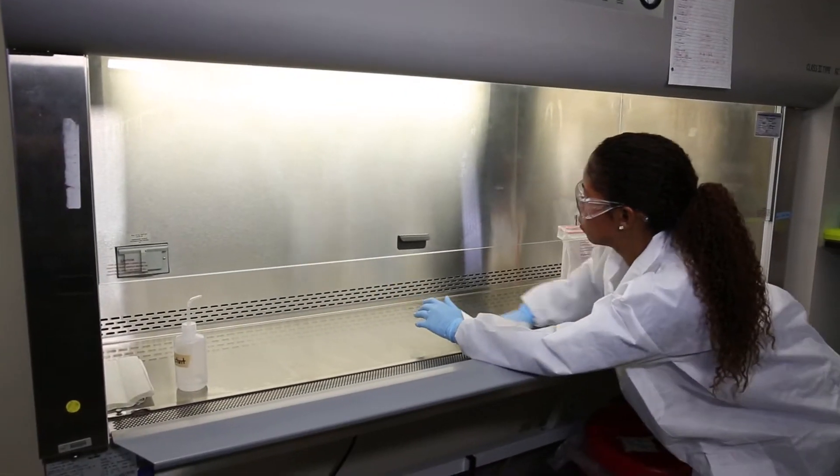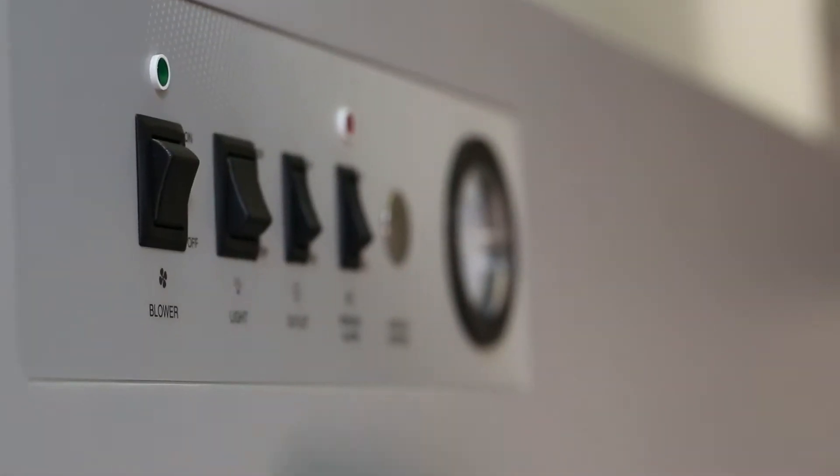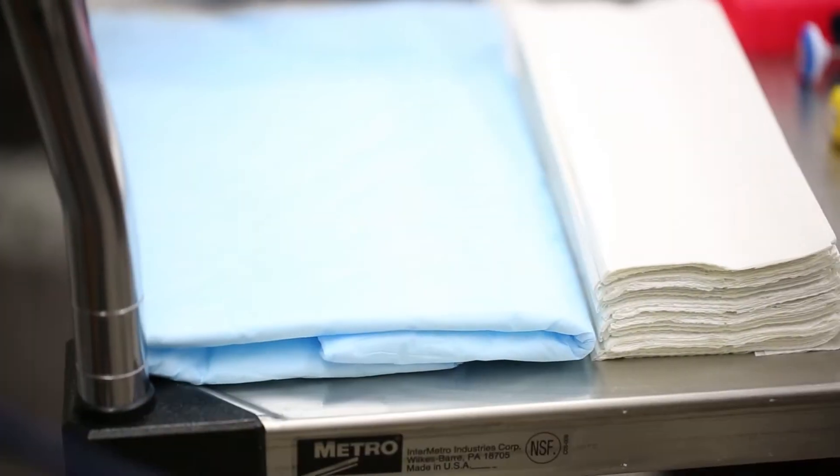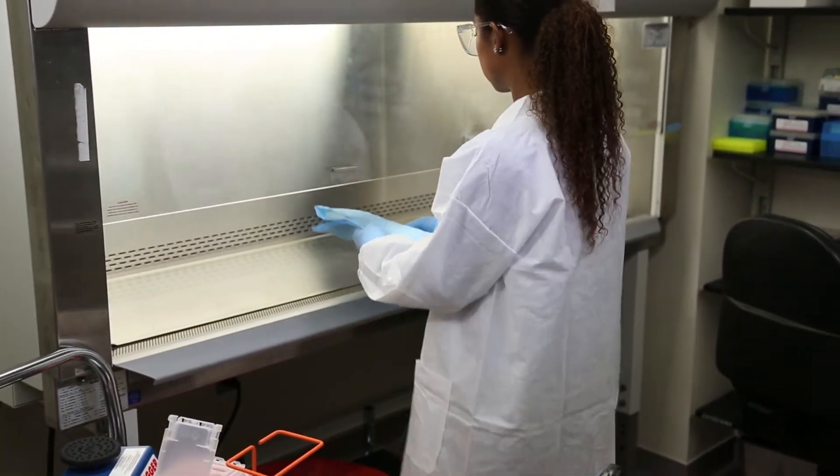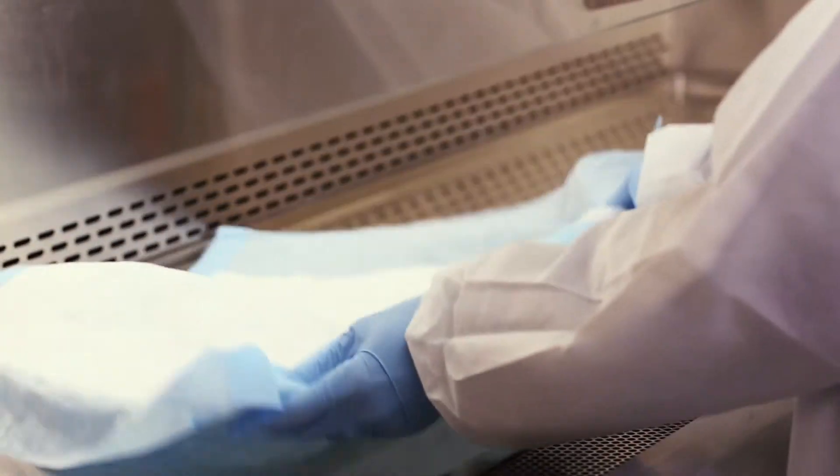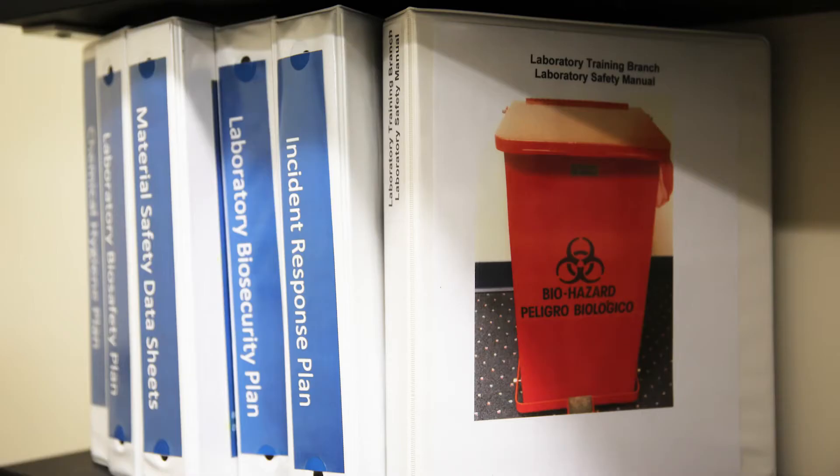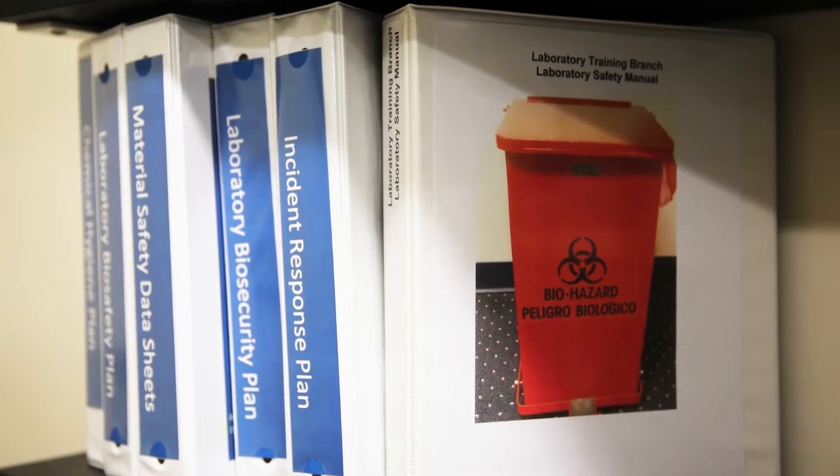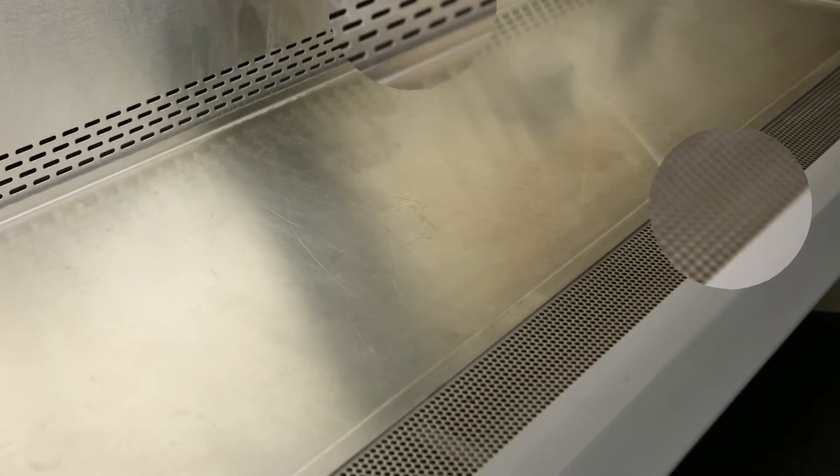After you have completed your initial decontamination, preparation, and checks of the BSC, you can begin work. Remember to wear PPE appropriate for the work you will perform. Some groups require that you line your immediate work area with absorbent plastic-backed material to prevent contamination of the work surface and facilitate cleanup. That practice is determined by a risk assessment and SOPs, but do not allow this material to block the front or rear air grills.